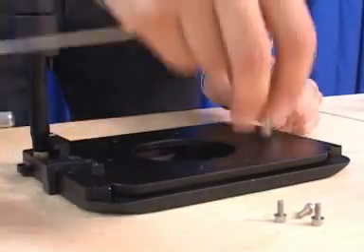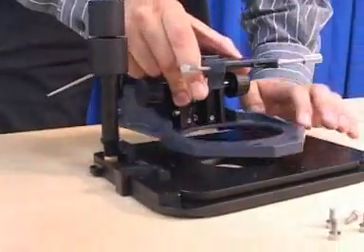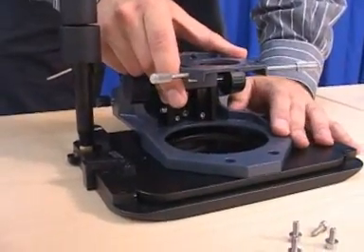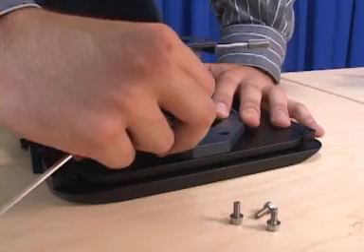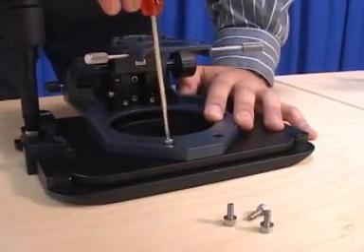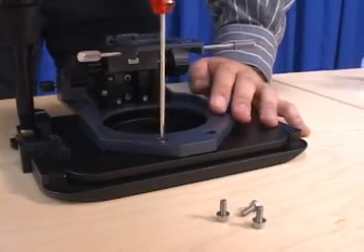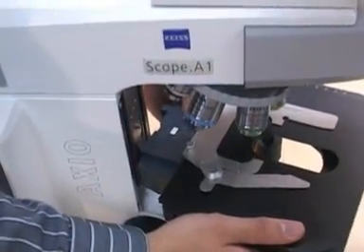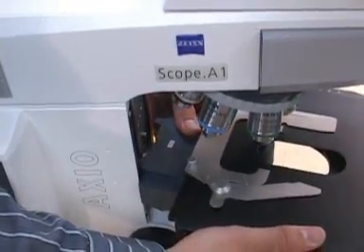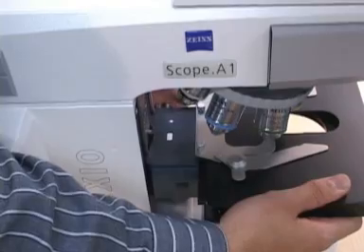Install the stage onto the stage carrier with four screws. Attach the condenser carrier to the stage carrier. By driving the condenser carrier down to its lowest position, two screws will be visible which will allow you to fasten the condenser carrier onto the stage carrier. Attach the stage-condenser carrier onto the focusing dovetail by engaging the left side first at a slight angle and then pushing it straight onto the focusing dovetail.